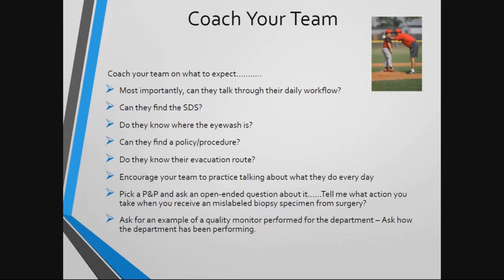And sometimes they really struggle to do that. Not so much because they don't know where they're at, but because they're just nervous. So practicing with them is very important. Ask a specific question about a policy or procedure. For example, tell me what steps you would take if you receive a specimen from surgery and the container is labeled right fallopian tube and the requisition states left fallopian tube. Make sure that this process matches what is stated in the policy and procedure.